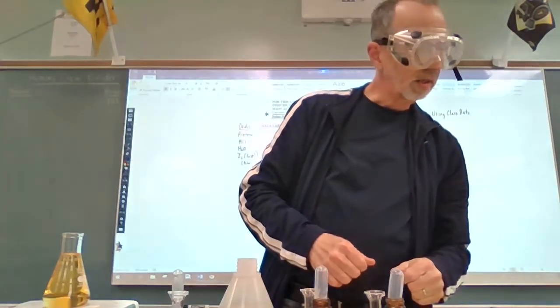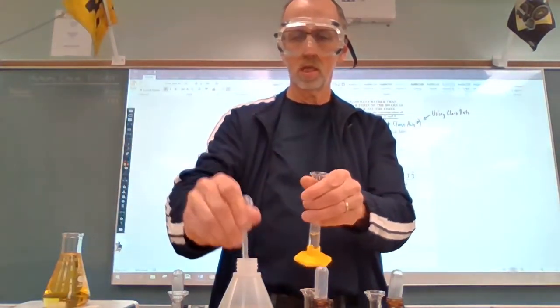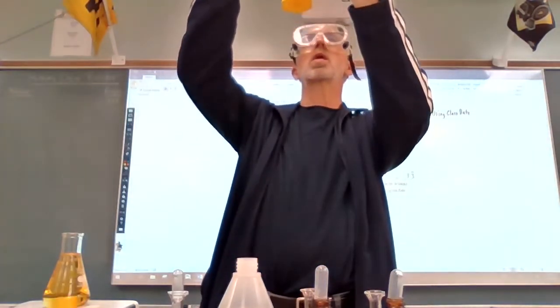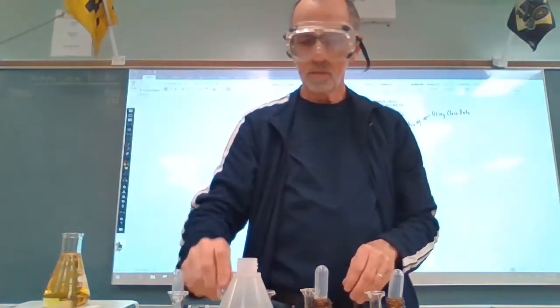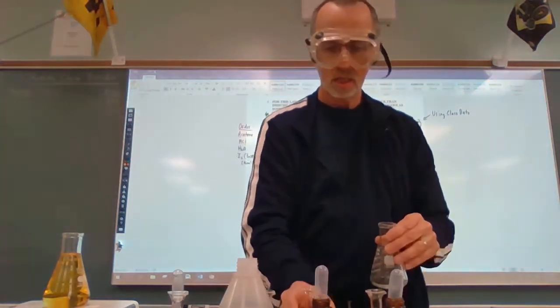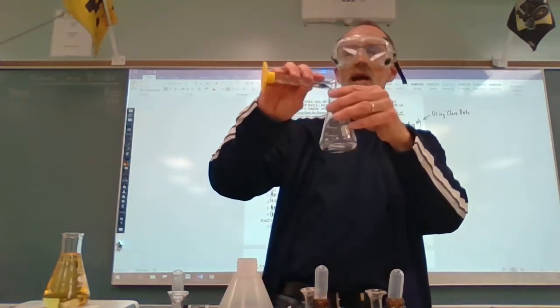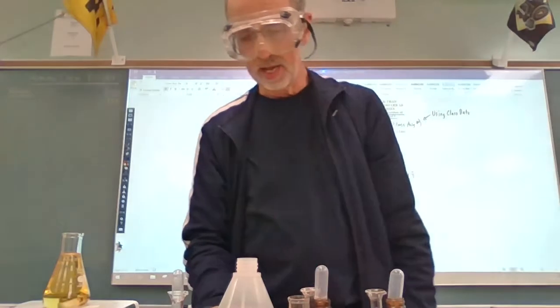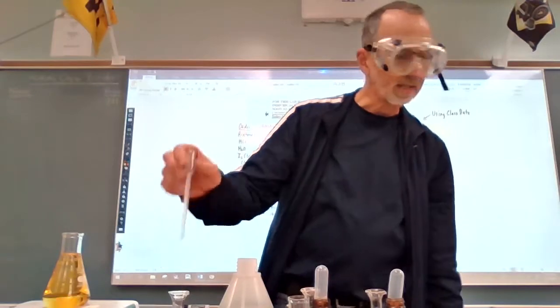And then 10 mLs of water. Okay, I'm going to go ahead and add those in that order to our reaction flask here, Erlenmeyer flask. And then I'm going to need 5 mLs, yes, of iodine.